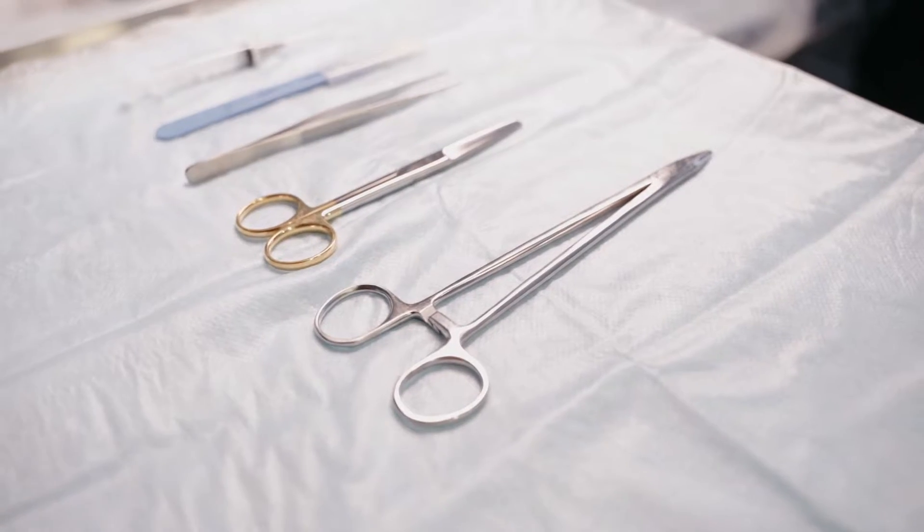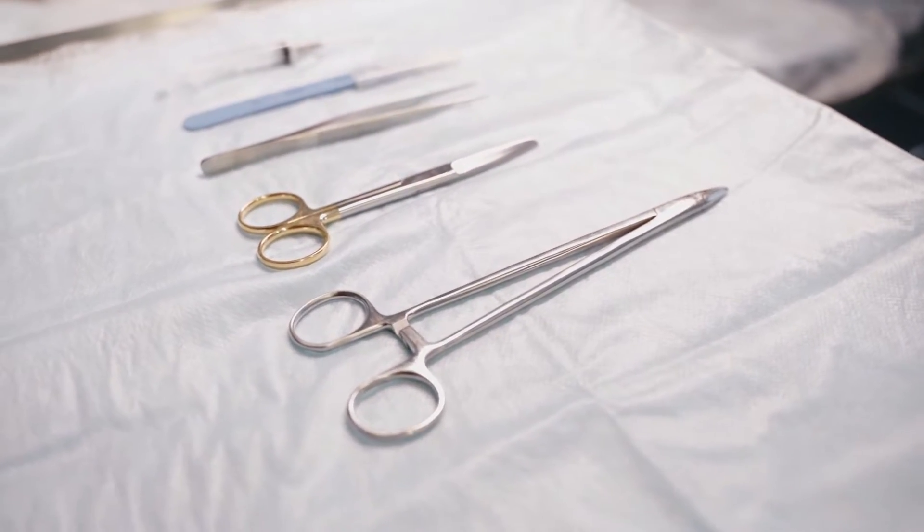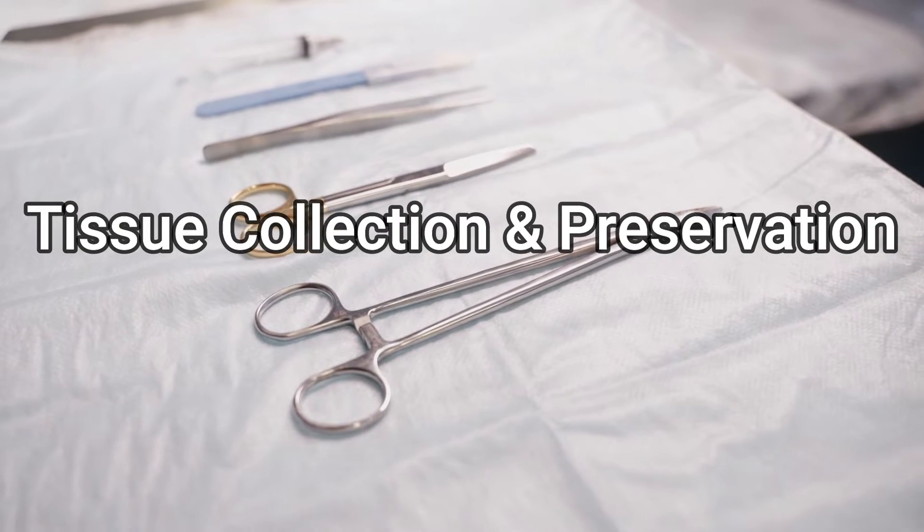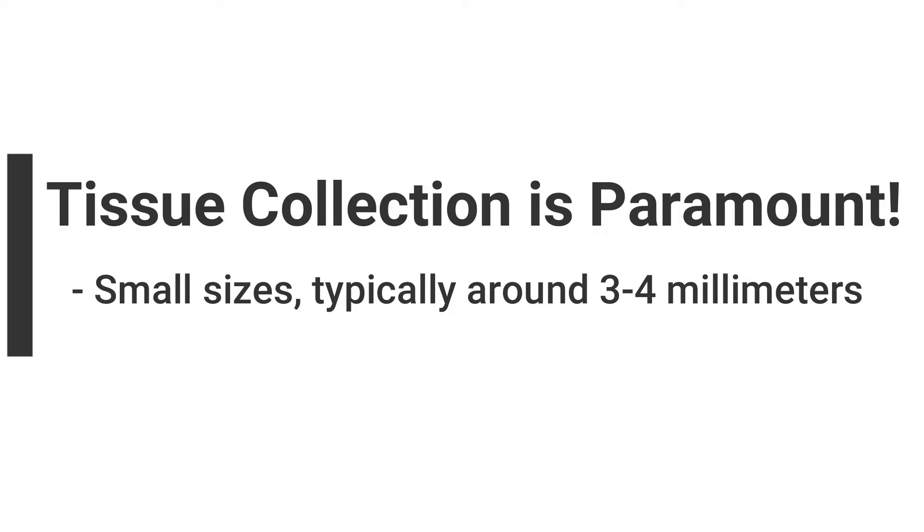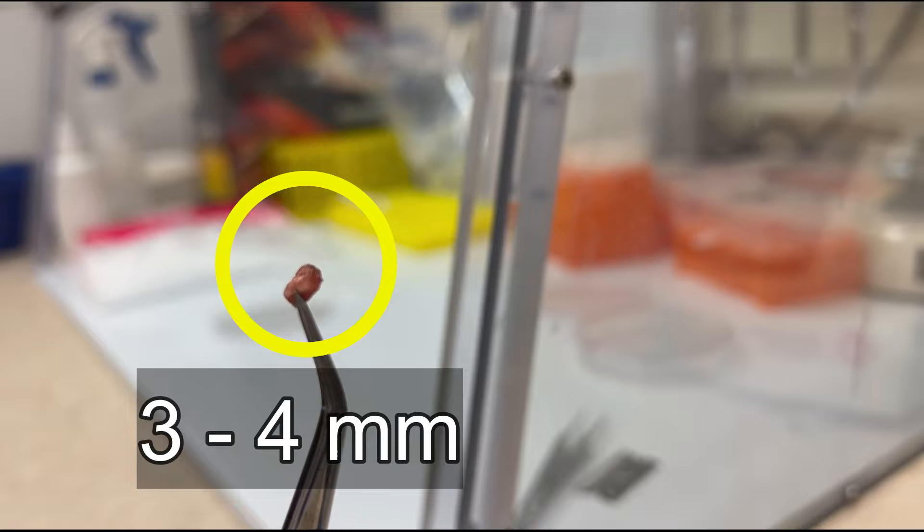Before we jump into the lab work, let's talk about the critical step of tissue collection and preservation. Tissue collection is paramount, and your samples must be in small sizes, typically around three to four millimeters.